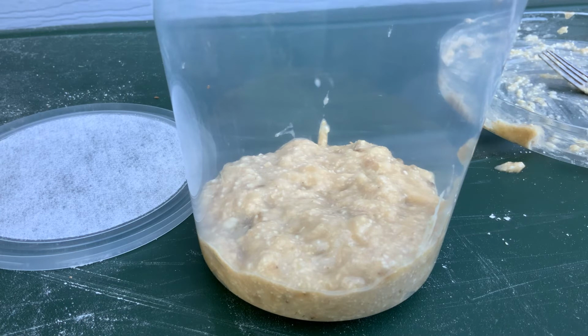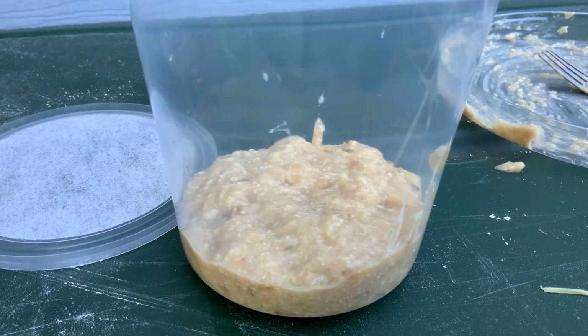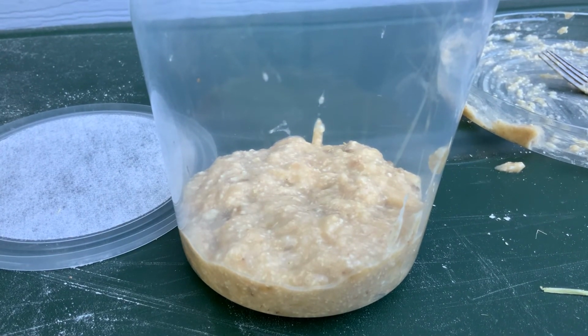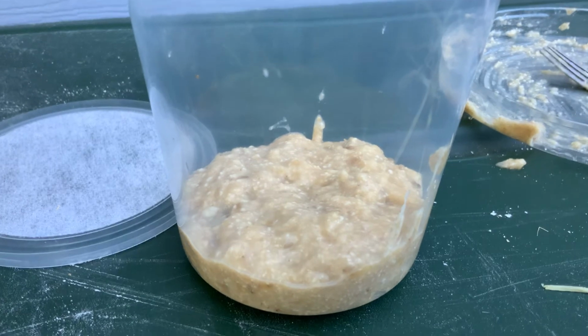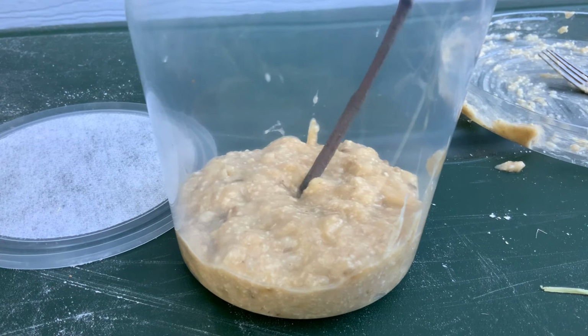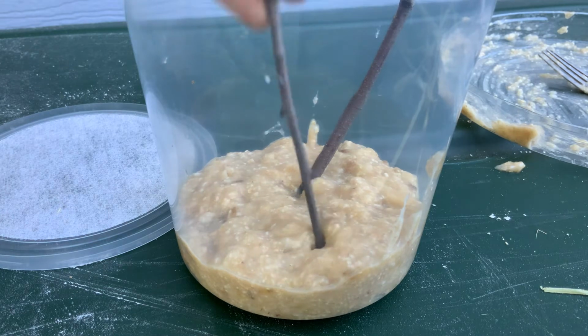Guys, I'm back. Sorry about that super long pause. So I'm actually going to use some straw. But since the pupae are really heavy, straw won't work out too well for them. And so I'm going to take some twigs, just like this from the craft store. And I'm going to stick some in there. Yeah, so just bear with me as I do this.